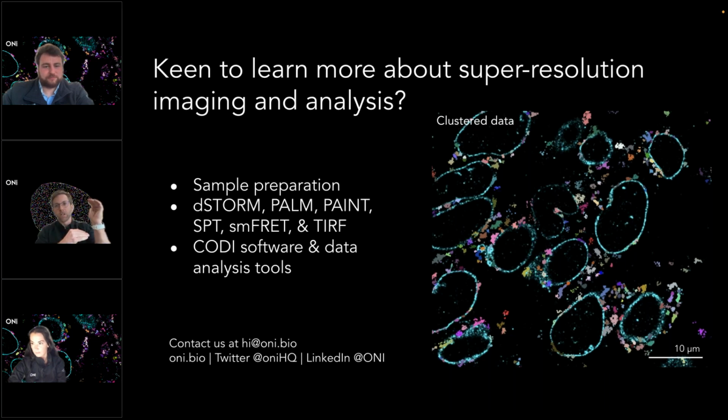All of our workflows in CODI are these kind of sequential workflows, right? So starting at drift correction and then moving on to the next steps. If we just follow those linearly, drift correction is the best way to see if there's visually something wrong with your data or if it needs to be corrected. So that rainbow streaky view is a really good way of doing it.